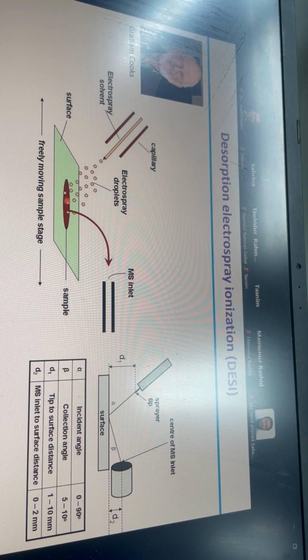Because in other analyses, if you have a protein, we collect all the protein and we run them all at once. But for cancer or injury, with this type of sample, you need to know what has happened in each and every part of the sample. So you do mass spec imaging.